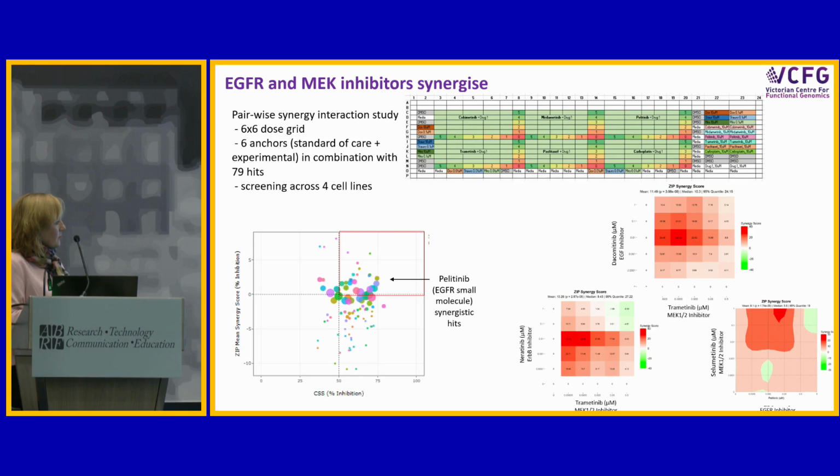So we still will rank a couple against each other. And these synergy plots over here show the different EGFR inhibitors at the bottom and the interactions we've got with just a couple of those target hits. And they're all coming up really robustly.